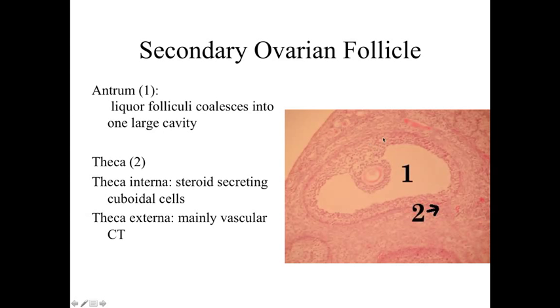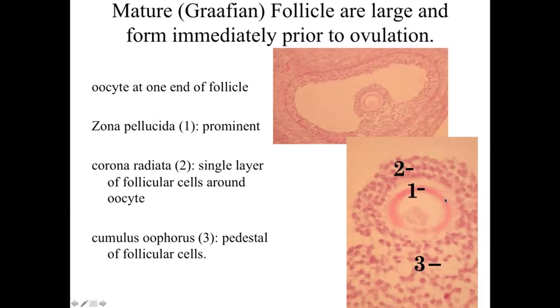In the secondary ovarian follicle, we have the oocyte with the very pink-staining zona pellucida around it and lots of follicular cells. We've got an antrum, which is the liquor folliculi coalescing into a large cavity. Then we've got the theca — the theca interna immediately underlying the follicular cells, and then the theca externa, which is mainly connective tissue cells — representing the specialization immediately surrounding the ovarian follicle.